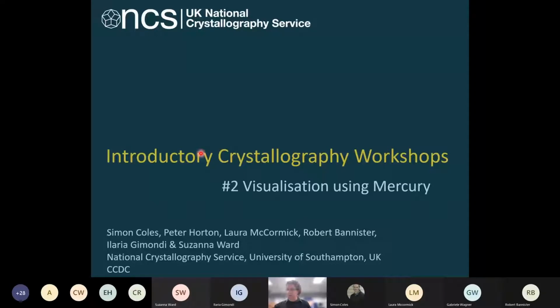Okay, so as Rob said, thank you for the intro. We're starting the second workshop, and this time it's all about visualization using Mercury.